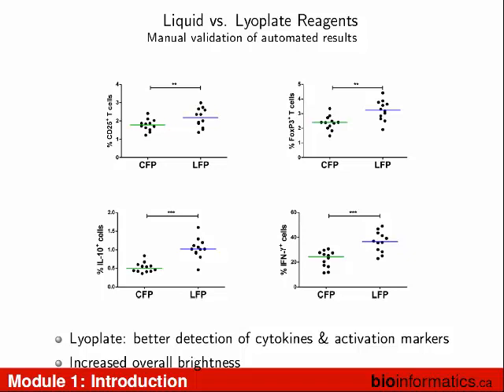How we set these thresholds can sometimes be a bit arbitrary, as we're trying to find the best separator. But there's a lot of math and stats behind that which I haven't shown you, because that's not the place for this. But it's all built on statistics, I guess is the best answer. I'm almost done. I just have four more.